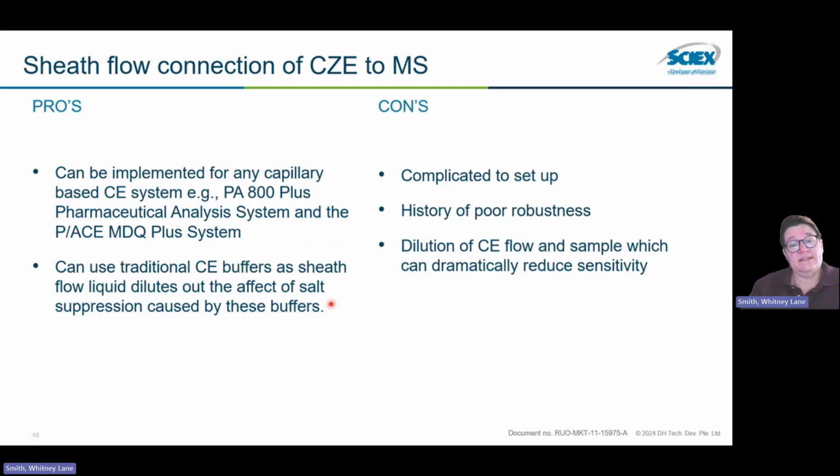Some of the cons is it can be complicated to set up. It has a history of being of low robustness. Also, because you dilute your CE buffer, you also dilute your CE analytes that you're looking for, which then dilutes your sensitivity, reduces your sensitivity.